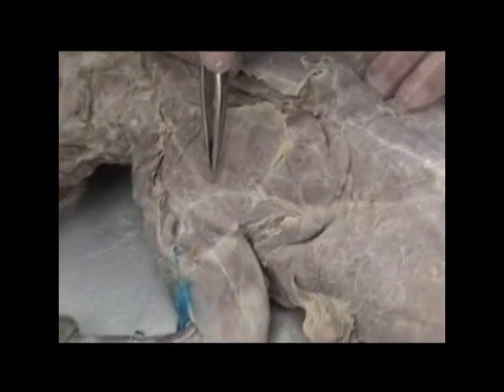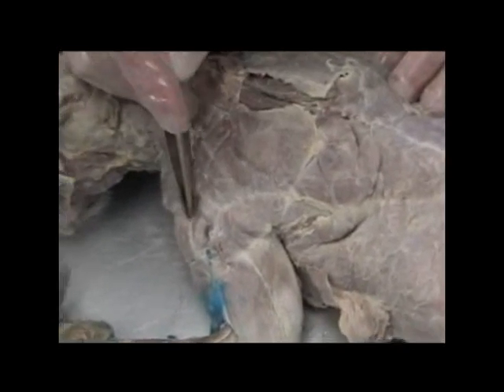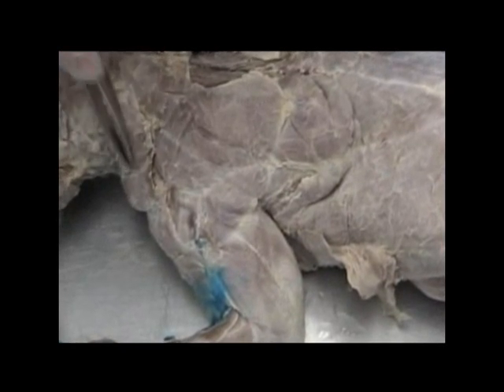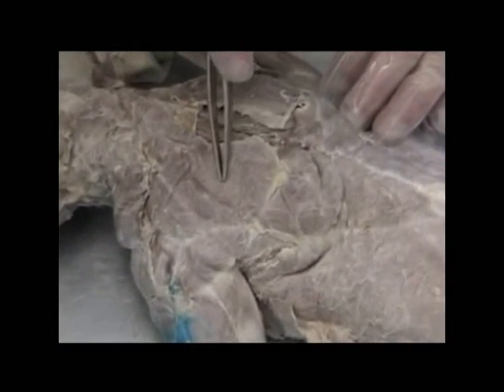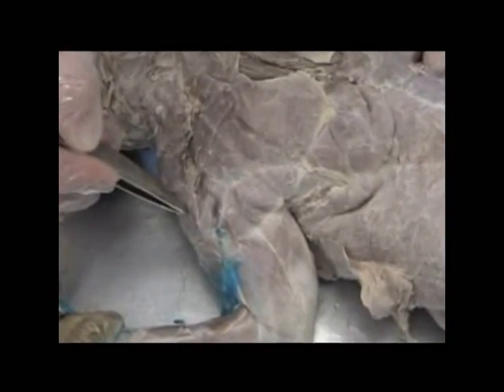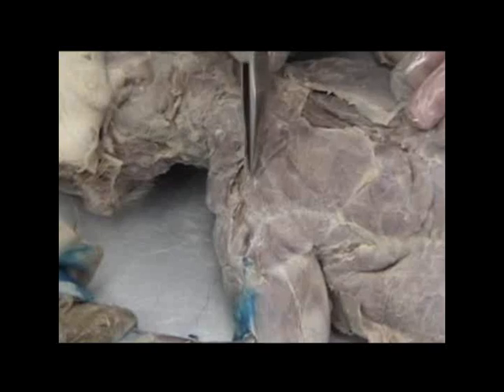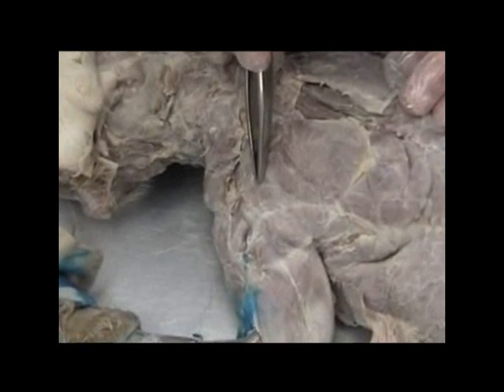Then moving down and doing the deltoid group, we have the spinodeltoid, this distinctive muscle right here, spinodeltoid, the little triangle, the acromiodeltoid, and then finally right at your shirt seam, the clavotrapezius becomes the clavodeltoid. So we have three traps: spino, acromio, clavotrapezius, three deltoids: spino, acromio, and clavodeltoid, also known as the clavobrachialis. The last muscle then in the superficial shoulder group is this band of muscle right here called the levator scapulae ventralis. My landmark for the levator is always that it sort of dead ends into the spinodeltoid. So this is the levator scapulae ventralis.